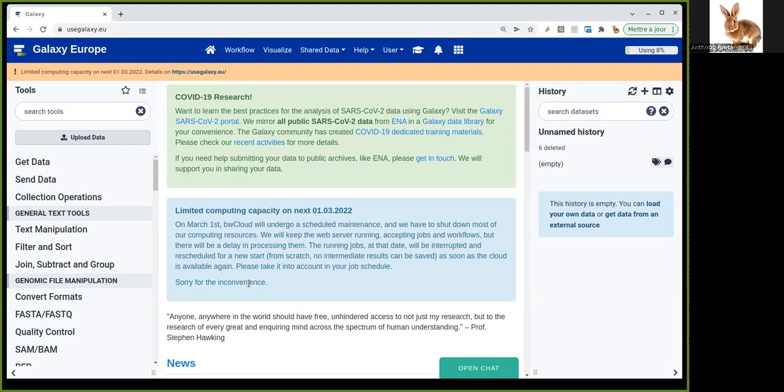The problem with these repeats is that they trouble the software used to annotate genes on the genome. So you often want to find the exact position of all these repeats and mask them from the gene annotation software.